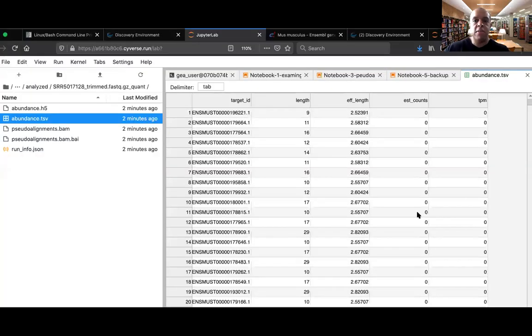Now, as I said, we're not going to go all of the way through an in-depth analysis of these counts and of RNA-Seq here. That's more advanced than what we wanted to do, and I draw your attention to the other series. But what we can do, and what we are prepared to do today, is just take a visualization and just by eye get a little glance at what that looks like.